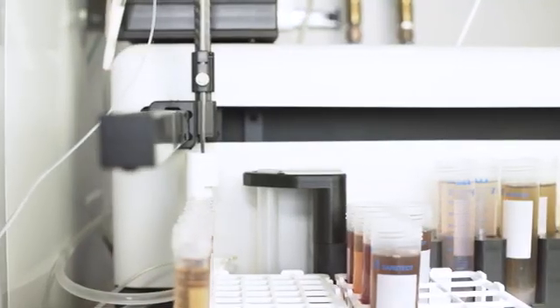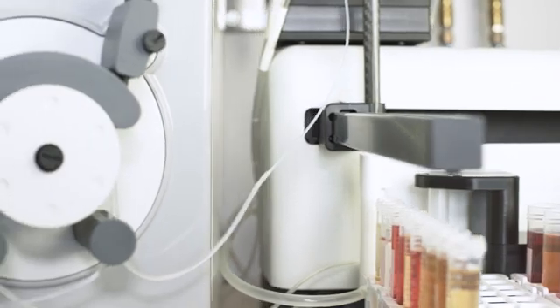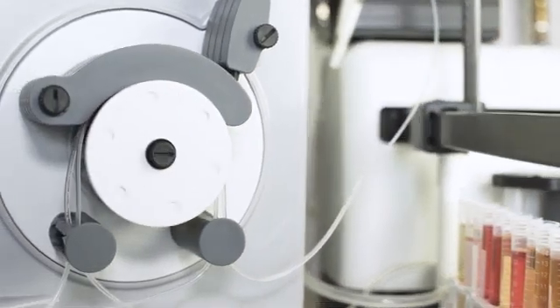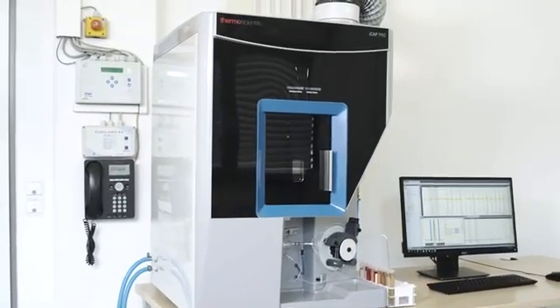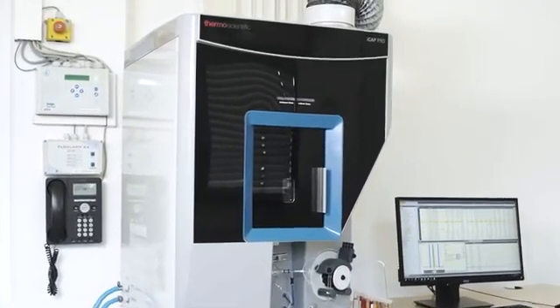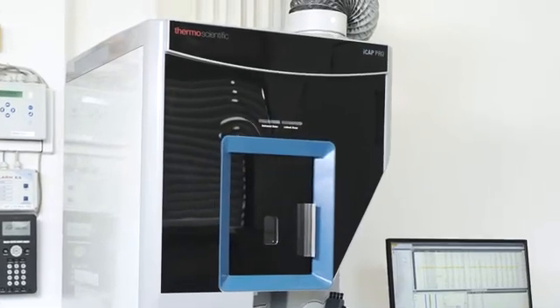The new platform attains a new level of robustness for the analysis of petrochemical, precious metals, and advanced alloys, delivering ultimate accuracy and precision. The iCAP Pro ICP-OES is the next generation solution for trace elemental analysis. Perform like a pro and win the race in trace elemental analysis.